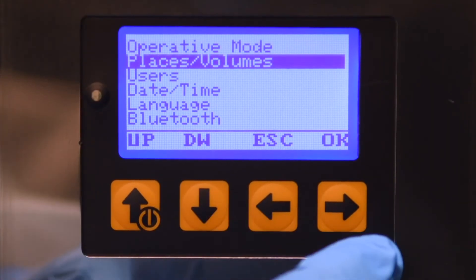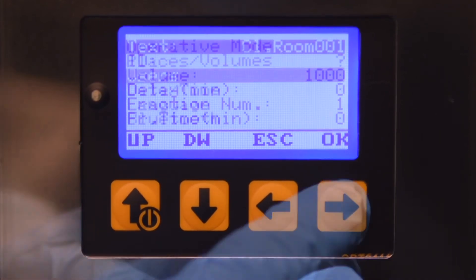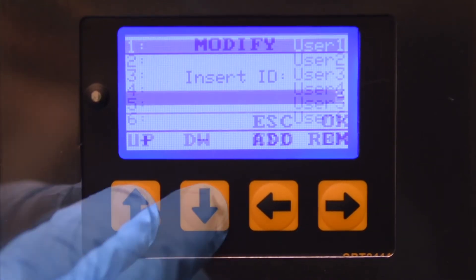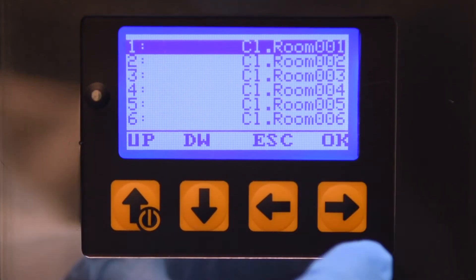In automatic mode, the operator can program specific named sampling locations, as well as user names and ID numbers. Up to 50 different configurations can be entered and stored.